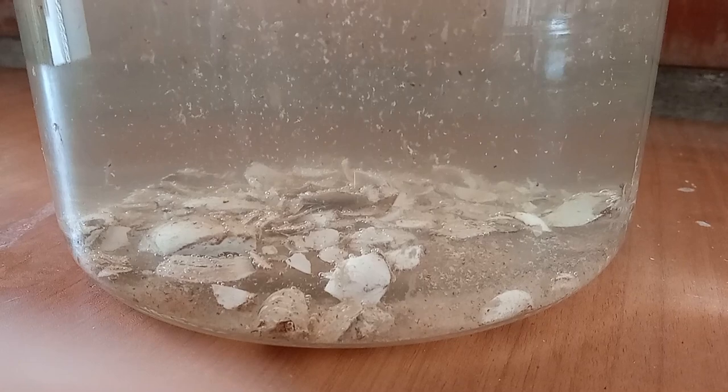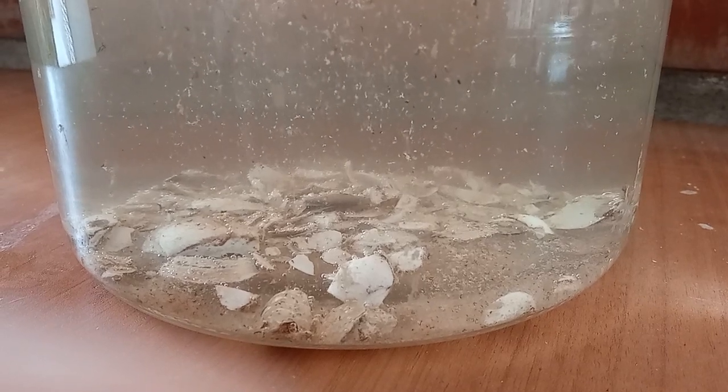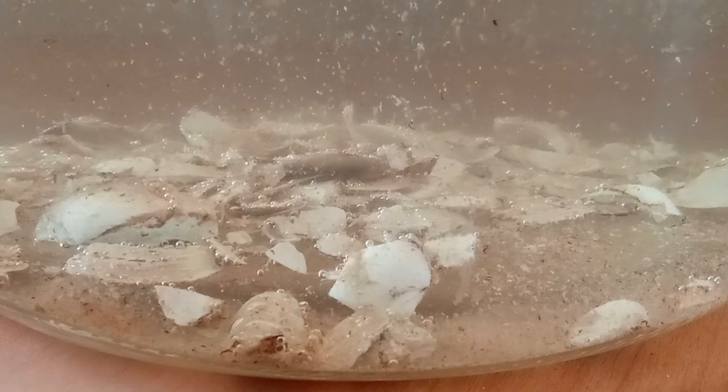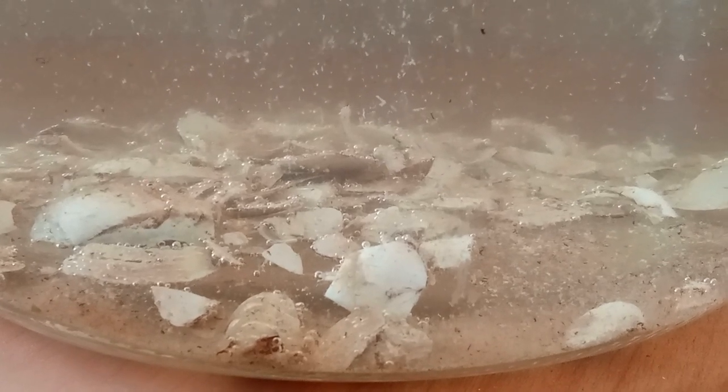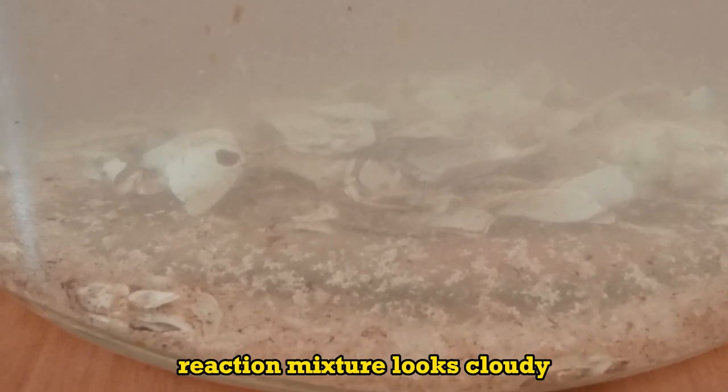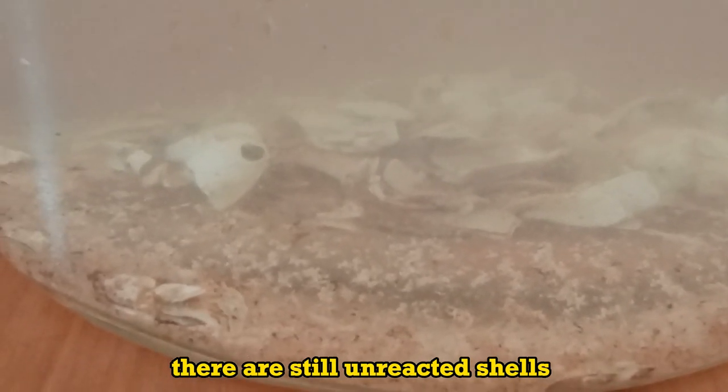After 2 days it looks like that. After a total of 4 days, the reaction mixture looks cloudy. There are still unreacted shells.